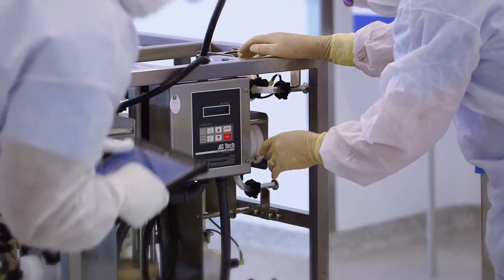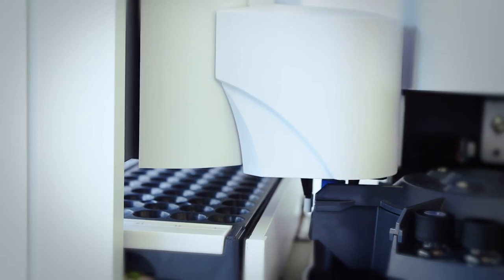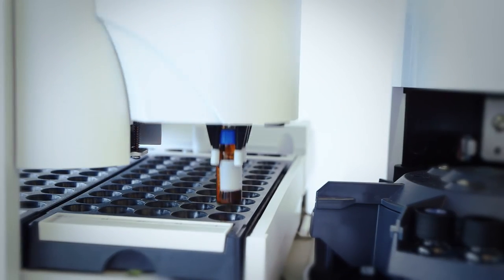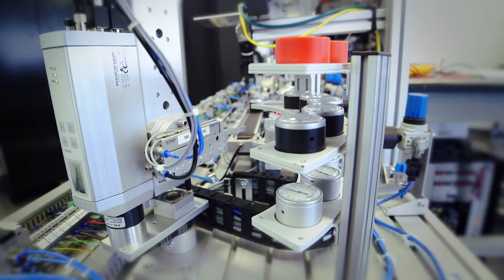This is probably the most state-of-the-art and impressive training center that we have. I think we've taken the best thinking and best practices from other facilities and really made this the state-of-the-art, best-in-class version.